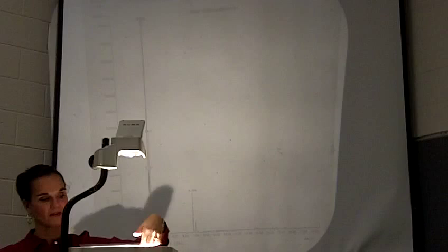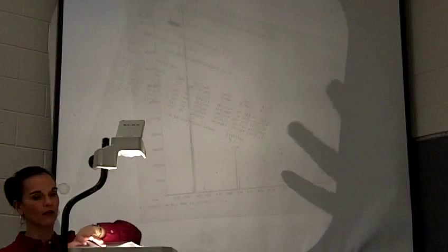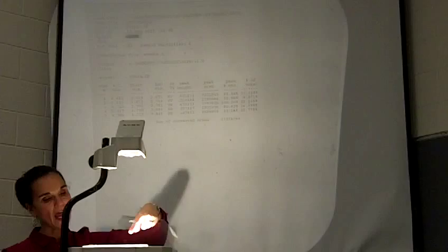And the other part is that you will get two pages with your data. You'll get this page, the chromatogram, and then you'll also get this page that tells you each of those peaks and how much of each peak there was, okay? So the percent of the total.